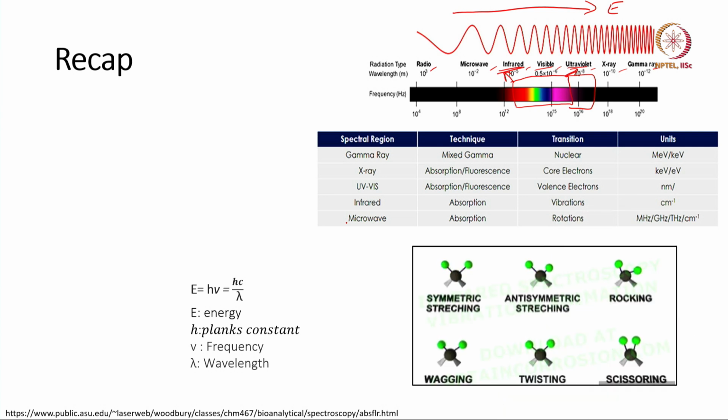In the first lecture we talked about the infrared radiation. Just to give you a brief, molecules have what is called a natural frequency. If we consider the analogy that our atoms are ping pong balls and the bond is a kind of spring, they have a natural frequency and the ability to absorb some part of the IR, and accordingly we get a typical IR spectrum.